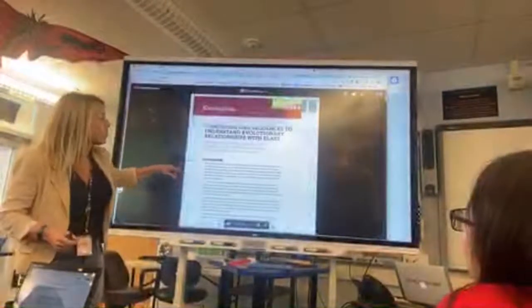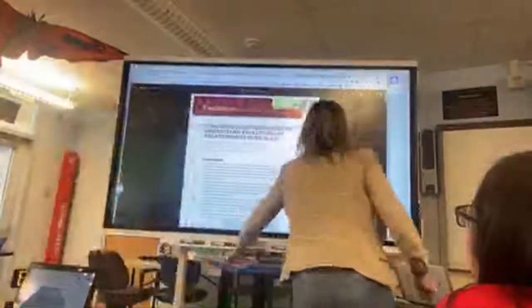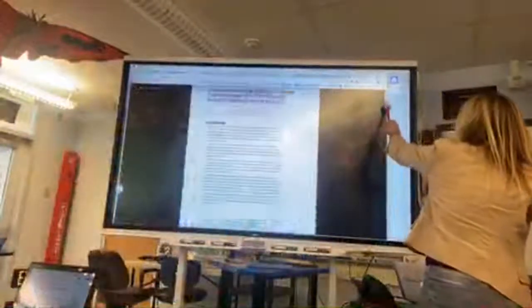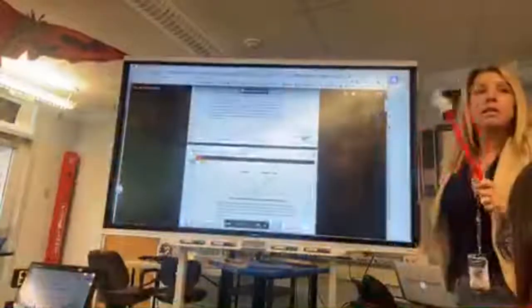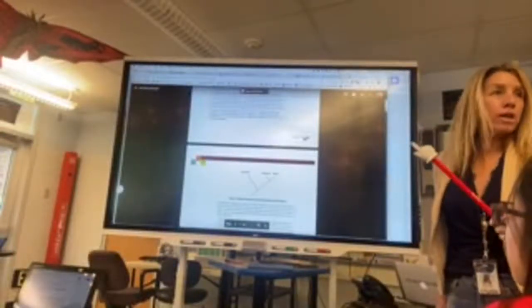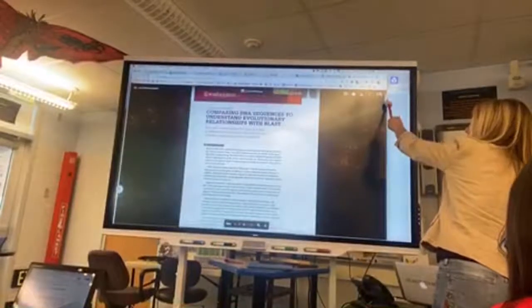So you can read that. The issue is at the point of publication, the directions for how to use BLAST, it's a website, were accurate, but they've changed since then. So I have updated, and so has the College Board.